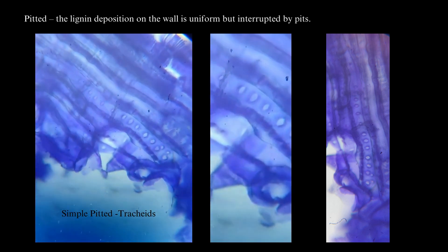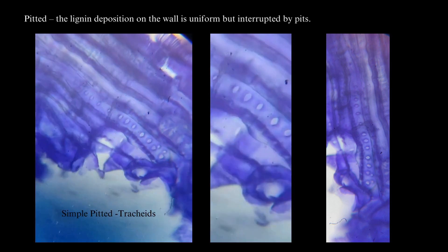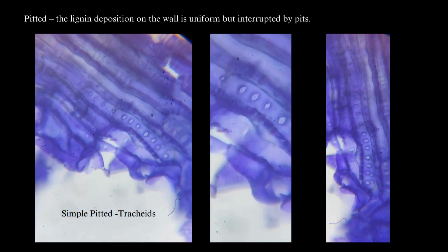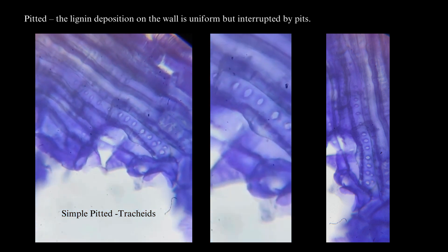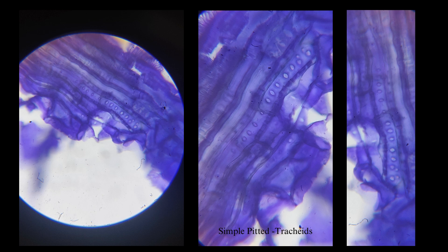This is the macerated wood material. Here you can see the tracheids — the lignin deposition on the tracheary wall is uniform but interrupted by pits. Pitted tracheids and vessels may have simple pits, that is without a border, or pits that are surrounded by a thickened rim of wall material, that is bordered pits. Here you are seeing simple pits.